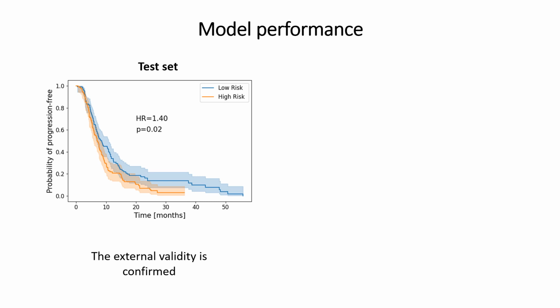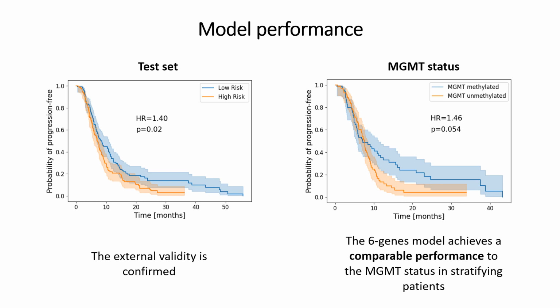To better understand how well the model performed, we compared its performance with the one obtained by using the MGMT methylation status, a well-established prognostic factor. The performance results are very similar, supporting the capability of the FLIM technique in extracting clinically relevant information.